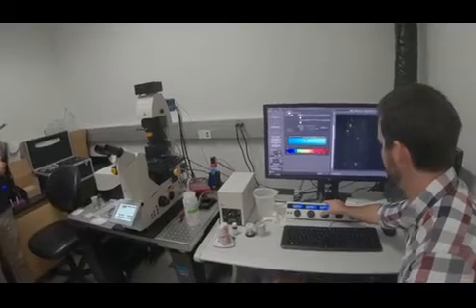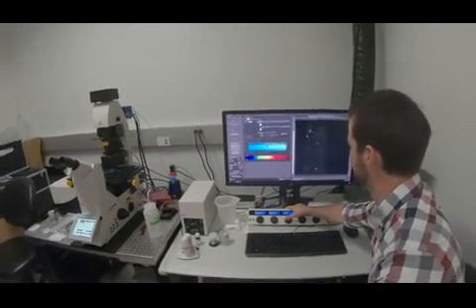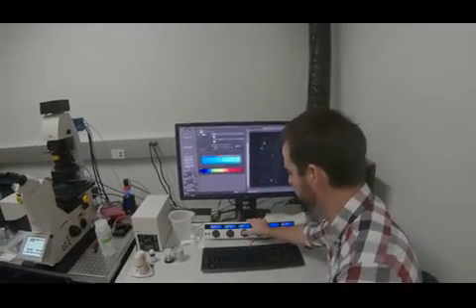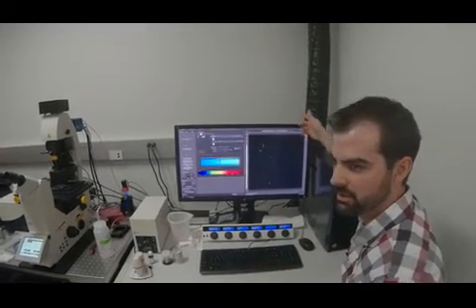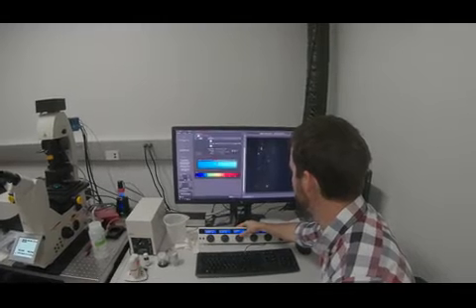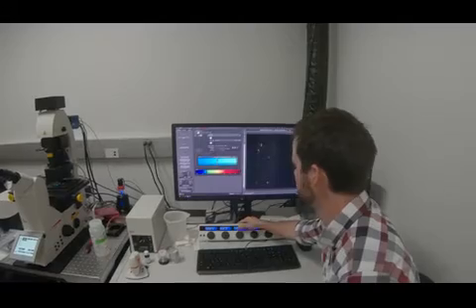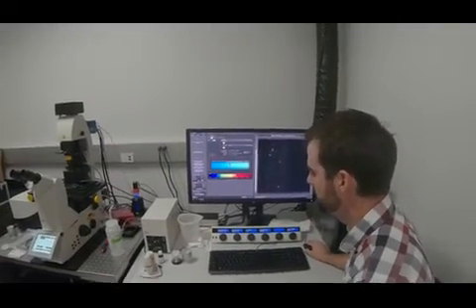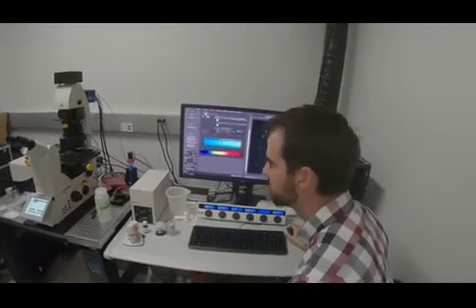So as part of the calibration routine with your sample, make sure that you're only exciting what you're imaging. So if I open it all the way, I'm exciting stuff out here that I'm not imaging, so I'm just causing photo bleaching for no reason. But I can zoom in and just move it, nothing changes. So 6.5 zoom level is what I need for this. If I stop, I'm done calibrating it.